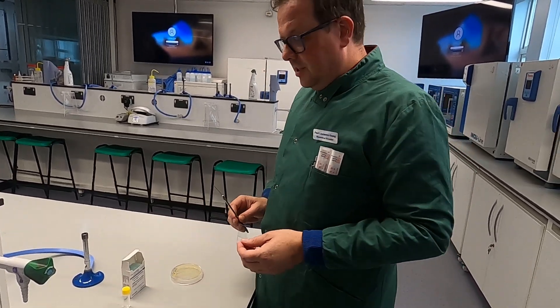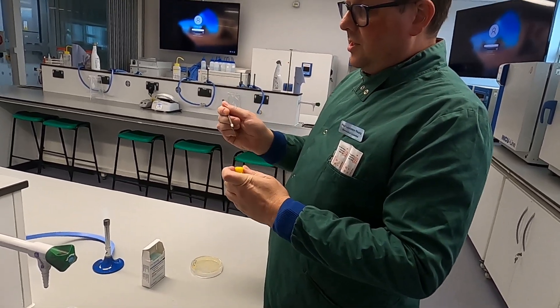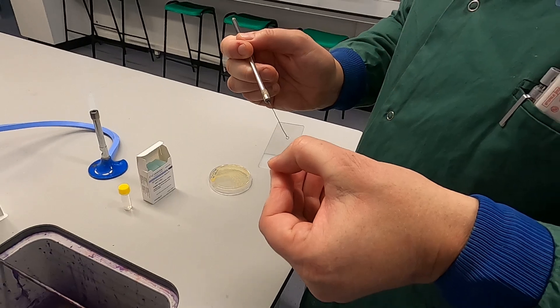To get yourself started, what you need to do is take your bijou of water, open it in a sterile manner, take a single drop into the loop, and with that loop apply it to the slide. Just tap it and it will come off.